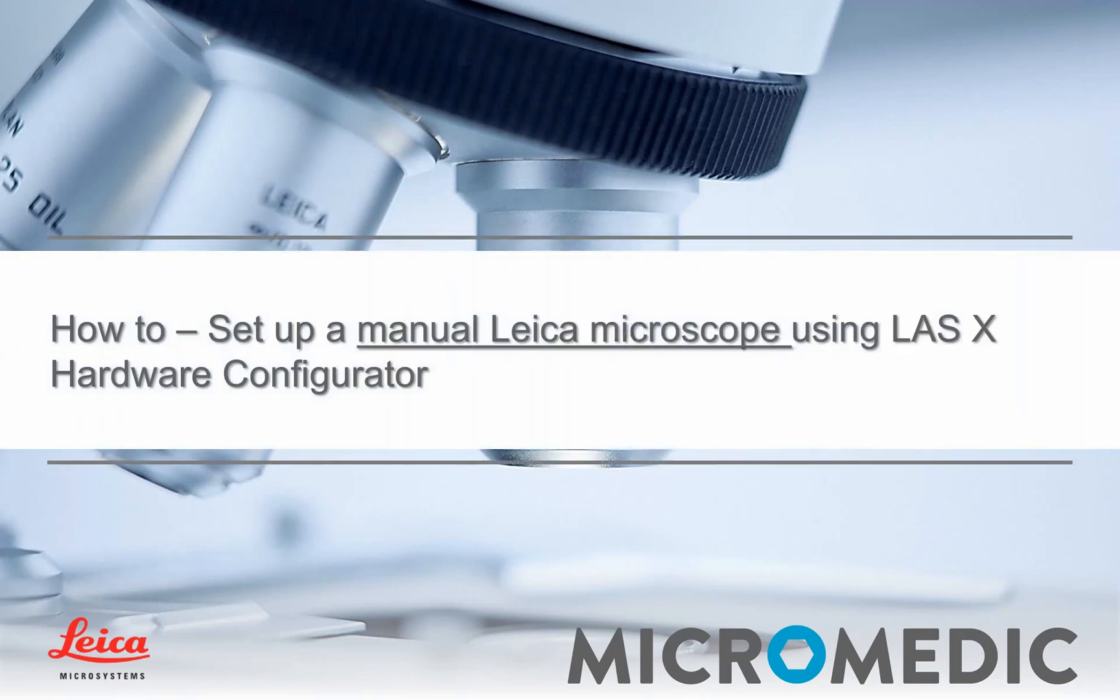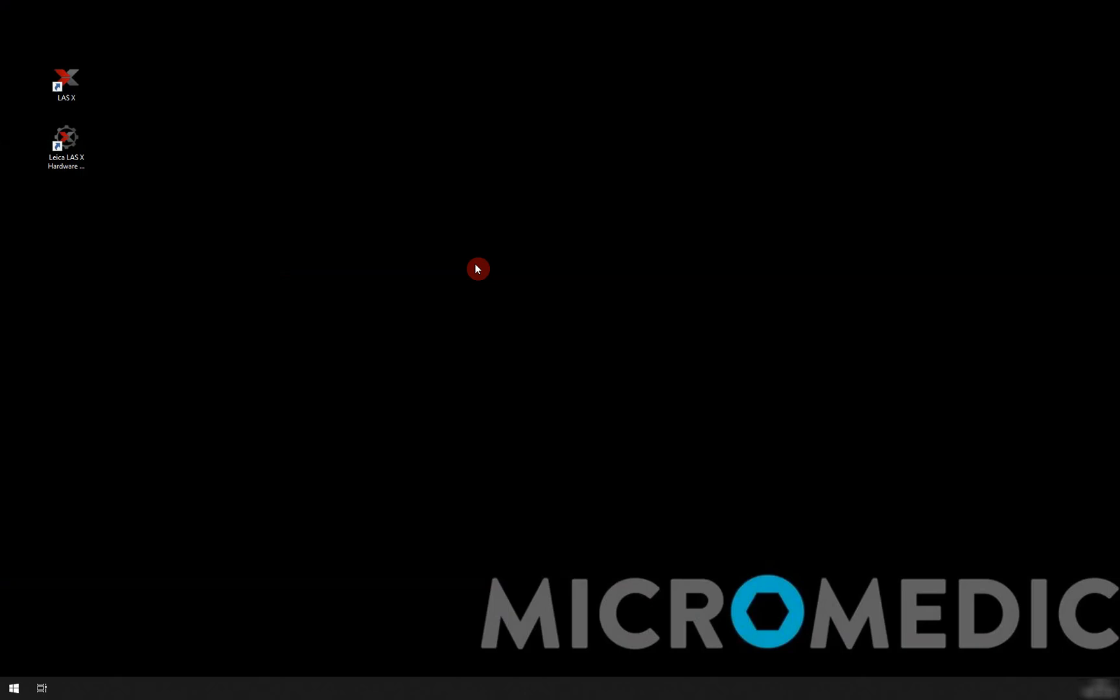In this tutorial we're going to have a look at setting up LSX to be used with a manual Leica microscope.